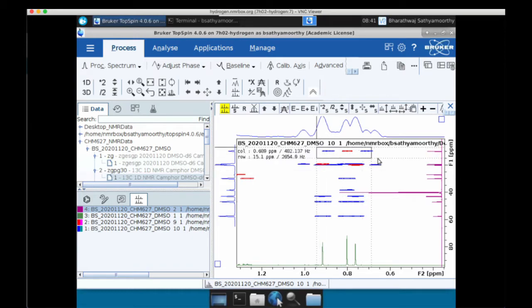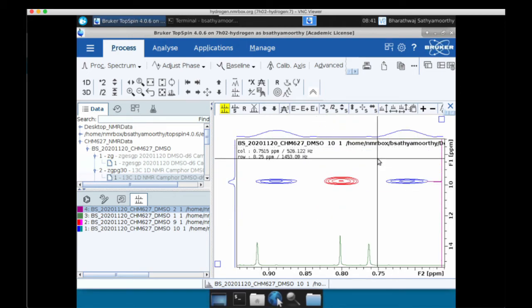Only if you see a proton resonance that corresponds, then it's an HMBC peak. For instance, when you have the red resonance here, which comes from the HSQC, you're also able to see the two blue resonances that are present. These come up although you don't have any protons that correlate with them. So that is the advantage of overlaying multiple spectra. Then you realize this is nothing but a single bond coherence that comes up as an artifact.